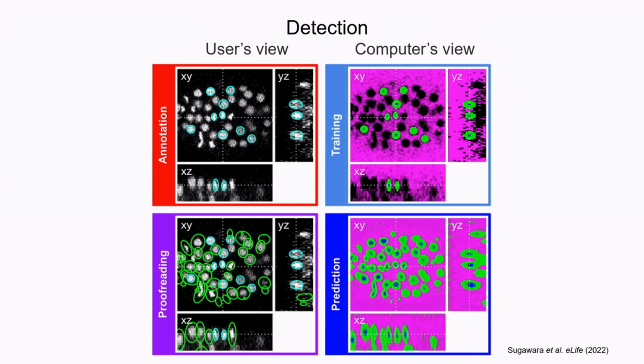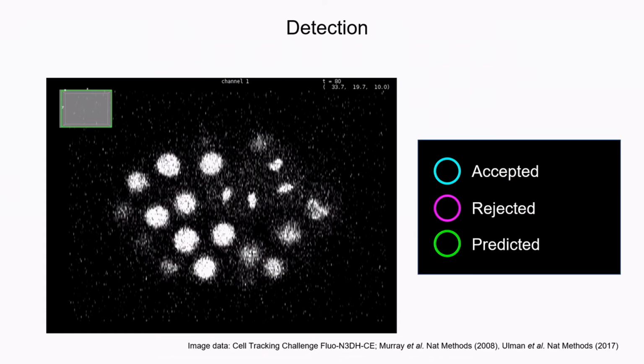The black areas are unlabeled, and these areas are ignored in training. So basically, this is a 3-class UNet model, and based on this training data, the model is trained and prediction is performed like this. Then we extract the blue area to reconstruct the cell shape, as shown here. Then the user proofreads the results and iterates this cycle.